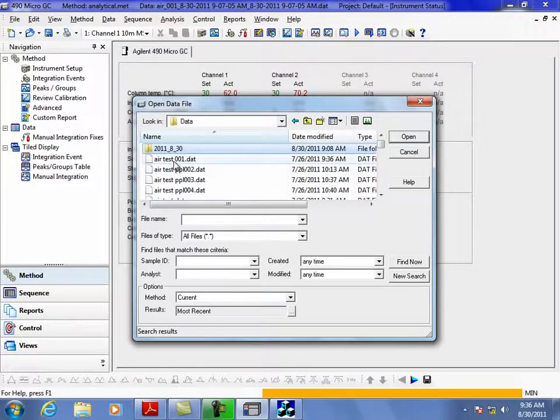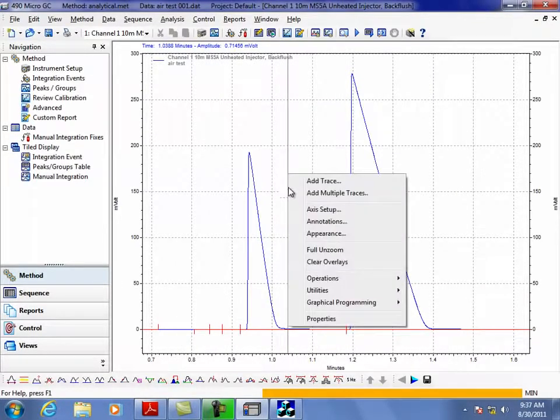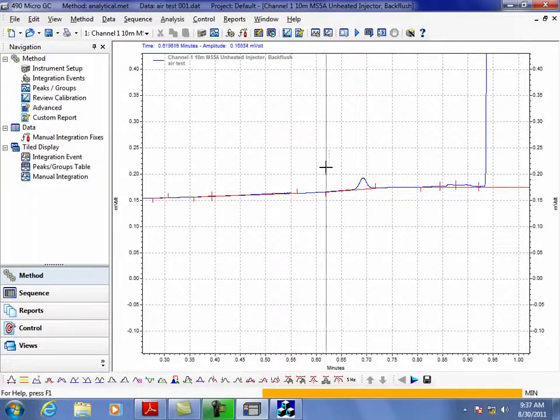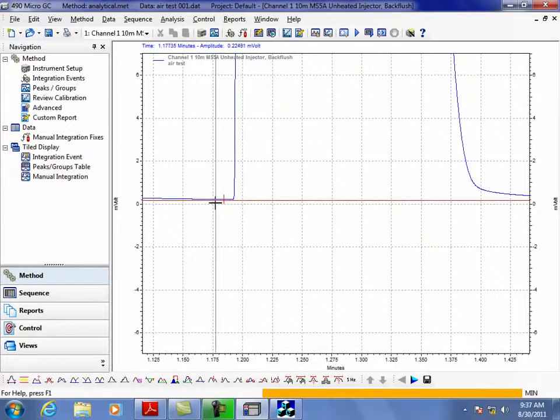I'll look at something here. Yeah, me too. That's one reason why you have such pretty and big peaks here. You'd know it the first time you tried to run hydrogen on it, because there wouldn't be any. You wouldn't be able to see it. That's probably a little bit of helium that was there from the other line. I'm surprised we don't see some argon right in this area.